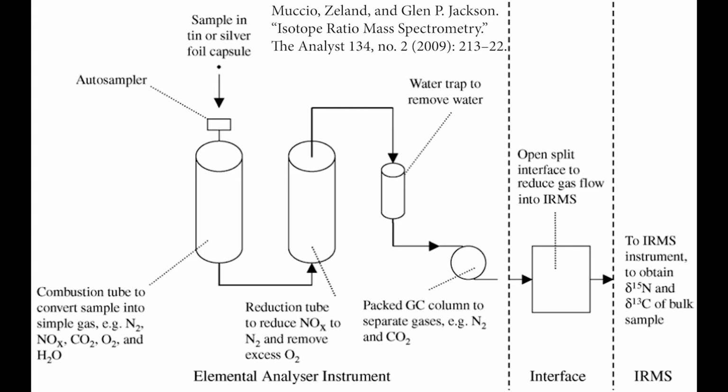Most of the carbon is, because remember, when you combust carbon, remember in general chemistry, the combustion reaction is carbonaceous compound plus O2 goes to CO2 and water. Well, you do that, and all the carbon is converted to CO2. You haven't changed the isotope ratio. You haven't changed carbon-12 to carbon-13. That's undisturbed, so the chemical form doesn't really matter, but CO2 is a lot easier to deal with.